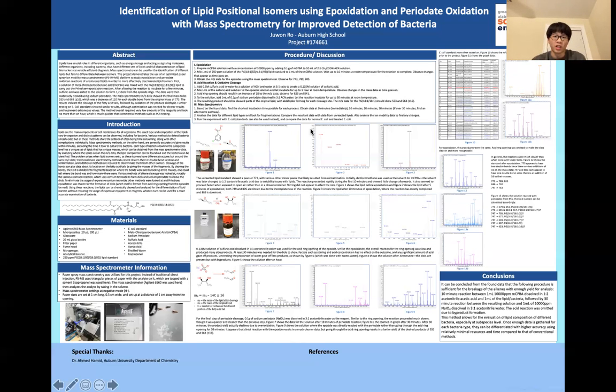But anyways, in the end, I omitted the acid step, but kept the other two and decided to roll with it. Oh, and also the periodate reaction was relatively quicker than the acid reaction, and it was mostly complete within 30 minutes.